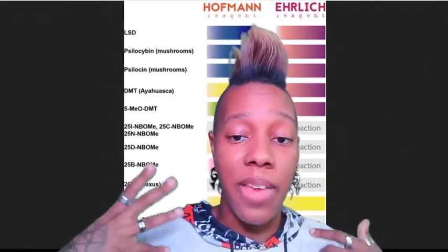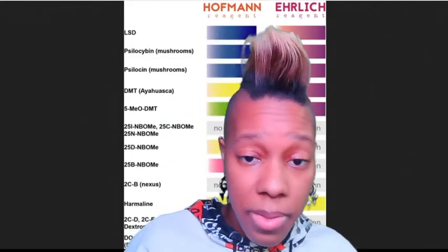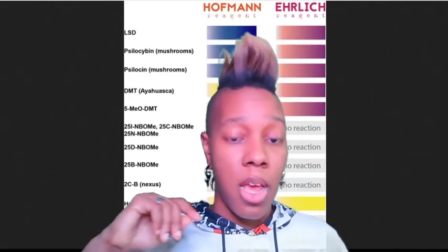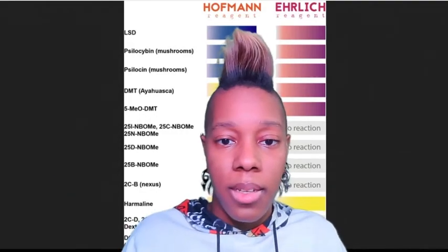If it's giving you no reaction and you test it with other reagents, DXM can be tested. 25B, 25D, 25I, etc. can be tested with other reagents. If you don't know what kind of mushrooms you have, you're in a ton of trouble.